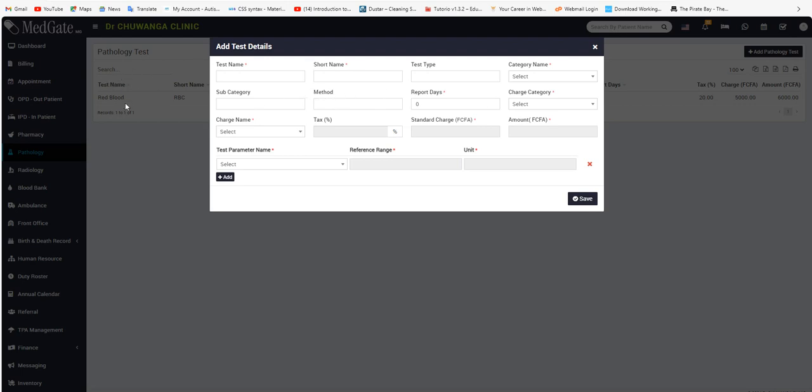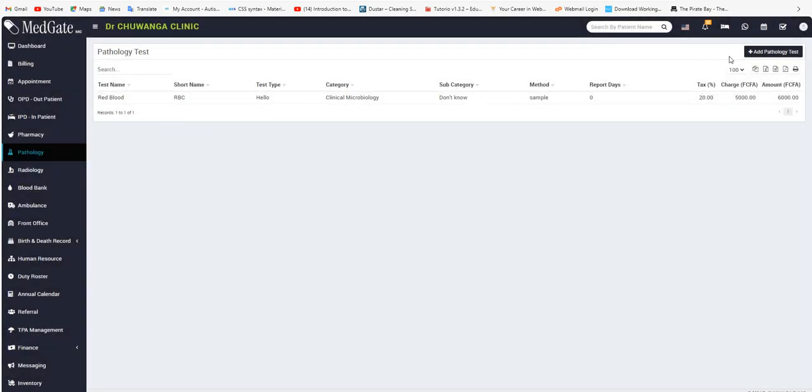So under serology, if you're doing a serology test for a patient, you're going to select each of the tests that you entered in the platform. We could have more sessions on that, so I can explain more details.